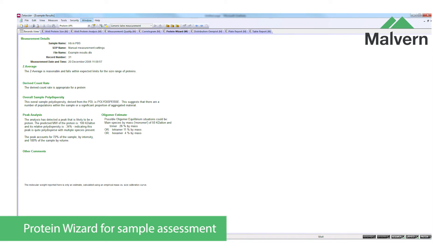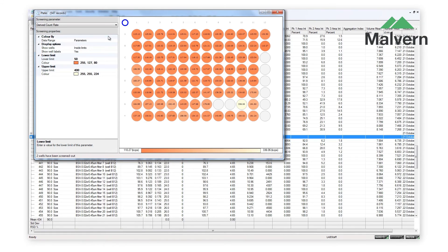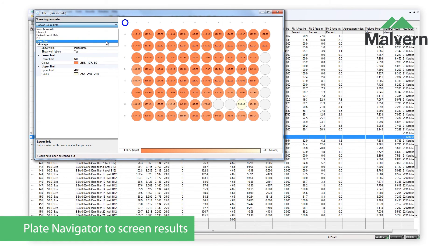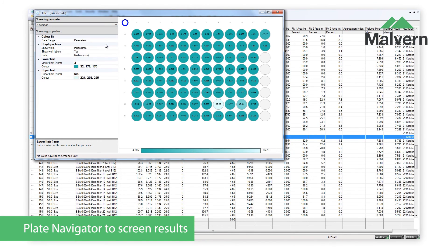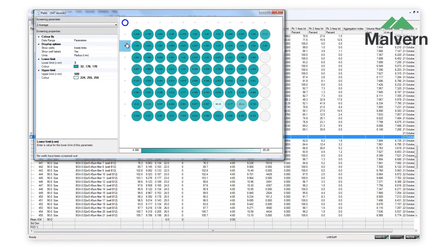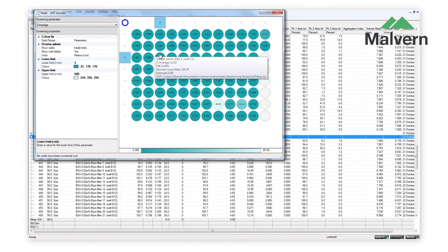It can give an idea of the total proportion of aggregates in a sample, the ratios of possible oligomeric structures, and can also suggest whether a sample might be suitable for crystallization trials. The Plate Navigator gives an overview of the data from the whole plate. Color coding allows users to easily distinguish between hotspots and trends according to any selected parameter, and wells can be labelled with individual results for detailed inspection.